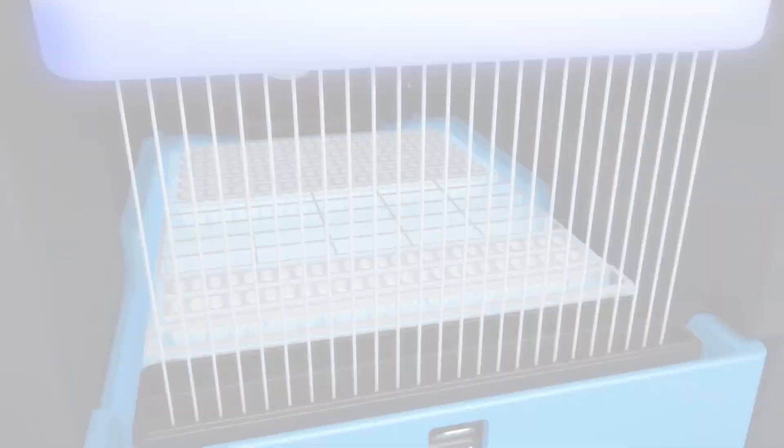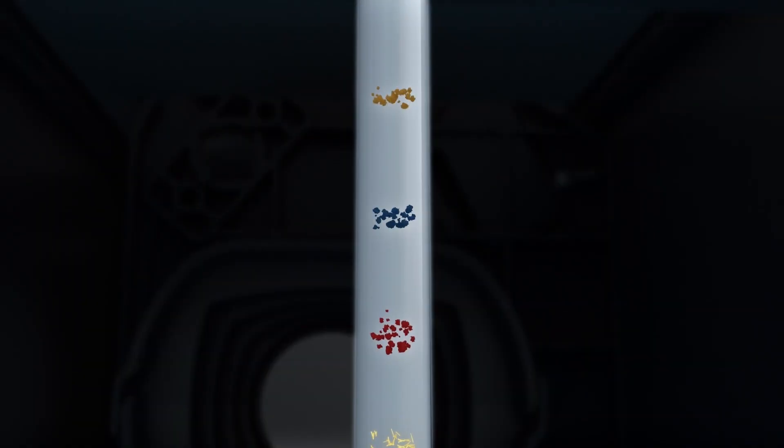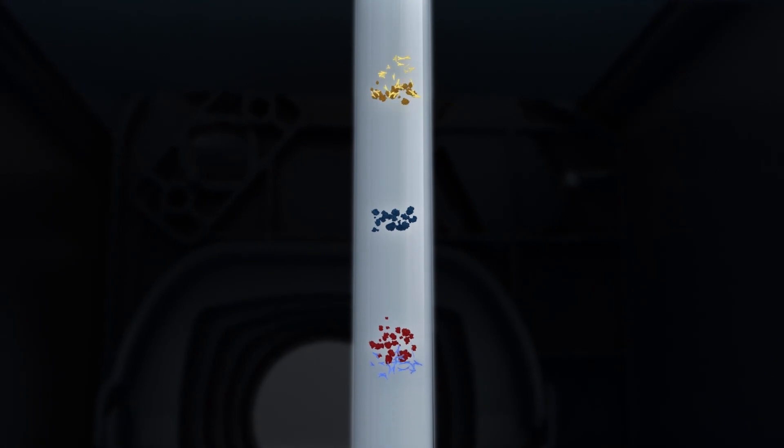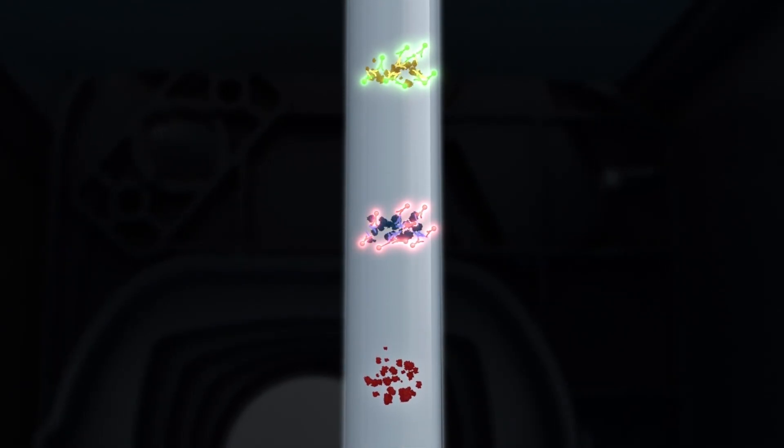For fluorescent detection, samples are incubated with the primary antibody followed by infrared or near-infrared secondary tagged antibodies. Excitation of the fluorophores releases photons and the emission spectra is detected and recorded by a CCD camera in a series of images over time.